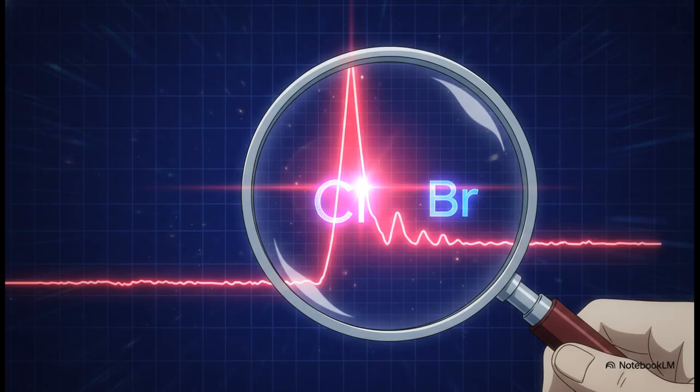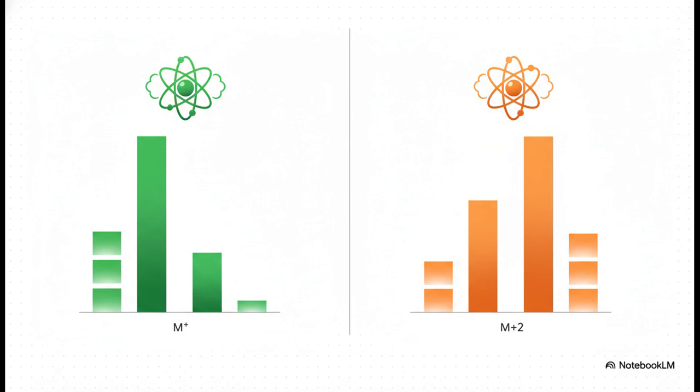Okay, so what if you see a peak 2 units after the molecular ion? Well, that's the M+2 peak, and it should be like a giant flashing red light in your brain. When you see a significant M+2 peak, you should immediately think halogens, specifically chlorine or bromine. And what's great is that they leave behind unmistakable fingerprints. If your molecule has a chlorine atom, the M+2 peak will be about 1/3 the height of the M+ peak, a 3-to-1 ratio. Why? Because the chlorine-37 isotope is about 1/3 as common as chlorine-35.